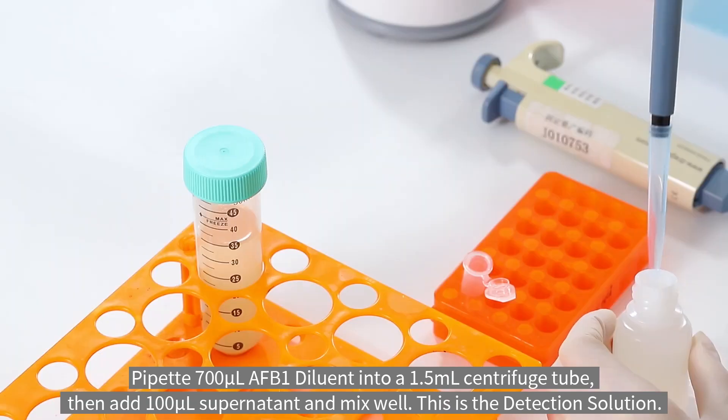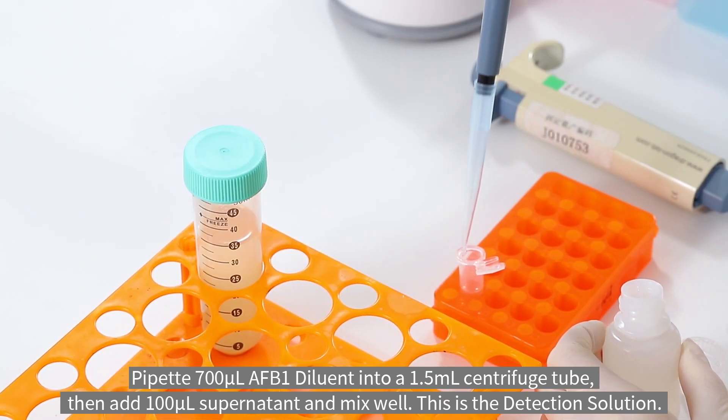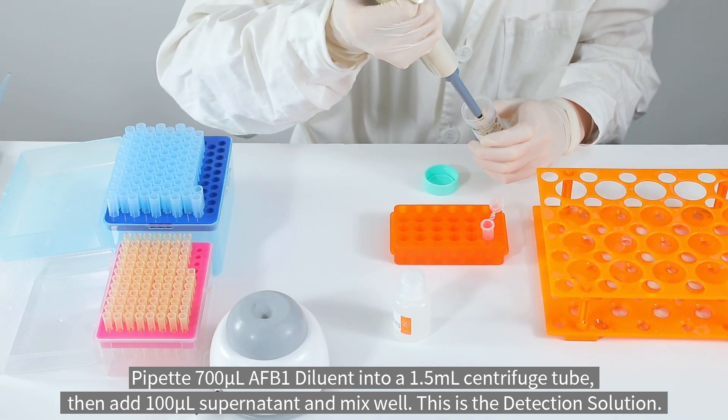Pipette 700 microliters of AFB1 diluent into a 1.5 milliliter centrifuge tube, then add 100 microliters of supernatant and mix well. This is the detection solution.